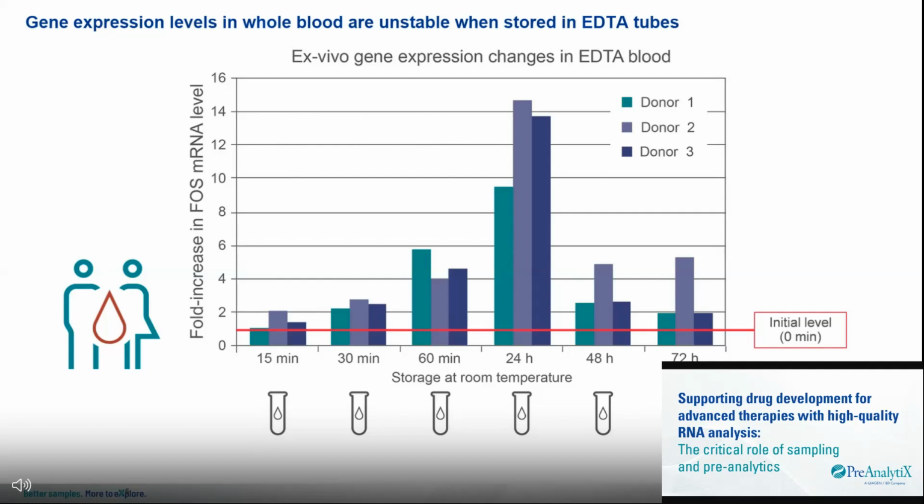But even in the laboratory, with additional storage time for batching multiple samples for a sample preparation run, and with the first analyte extraction steps, the sample can still change until it is lysed and all the vital processes are stopped. So the degree of changes is subject to donor-specific response. And we can see this here. These are 3 different donors, and you see different degrees of responses.